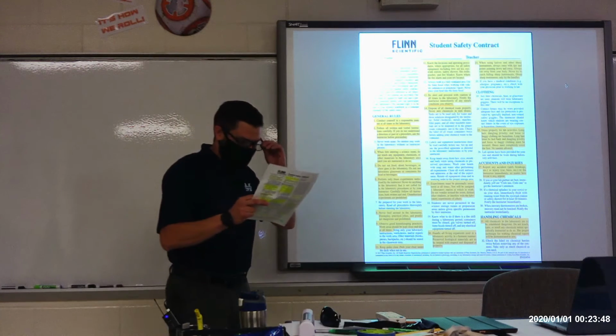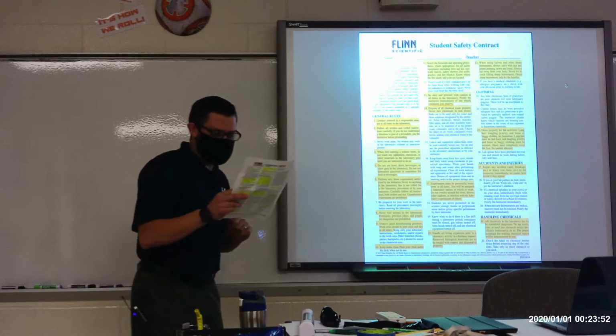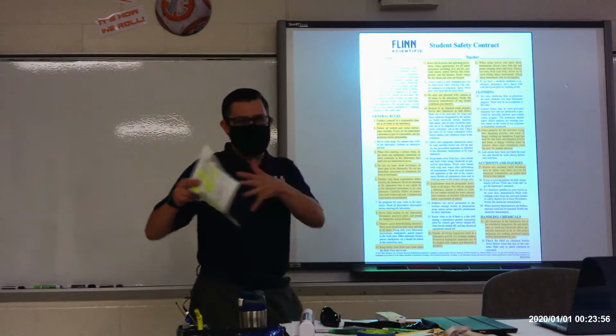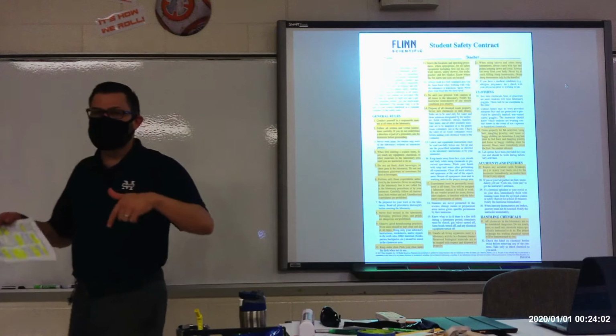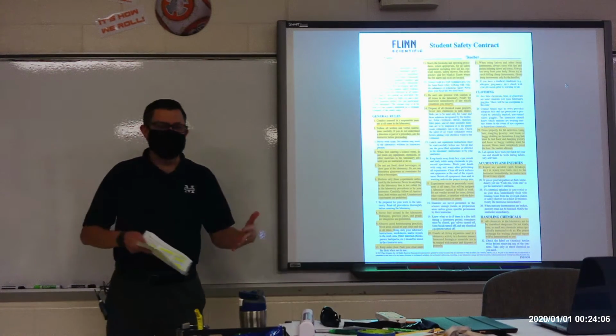All right. Skipping down to number 17. Experiments must be personally monitored at all times. If you're working on a lab, that's what your focus should be. You shouldn't be up and about, moving around, bothering other people, getting into their labs. You need to be focused on what's in front of you and your task at hand.